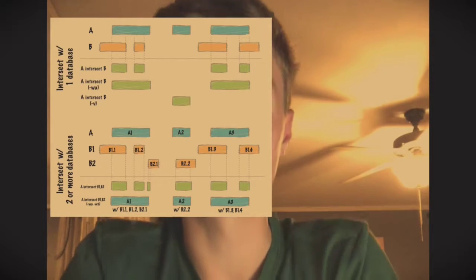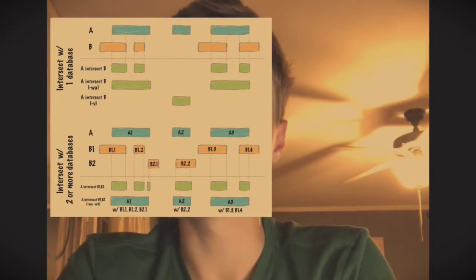So for our project, we're using the CNVs gathered from PennCNV, so the copy number variants of the samples from the source, as input A, and then we're going to intersect those with our input B, which is the list of genes that I created. So when we intersect these, we'll be able to better tell the similarities and the association between our samples from the project and the list, as well as the location of where the variation is happening.